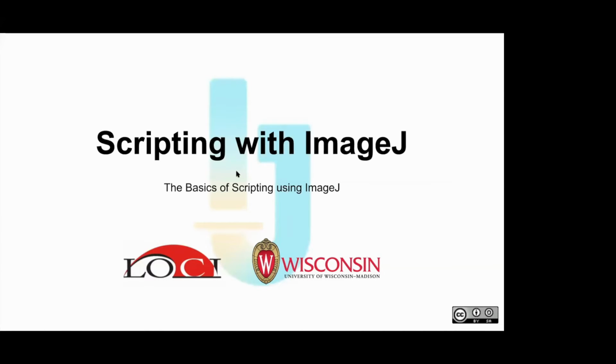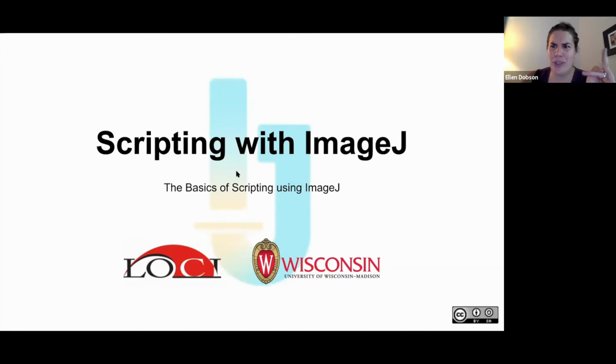Yes, thank you. Okay. I think there are tools out there from some distributors that allow you to check the overlap.